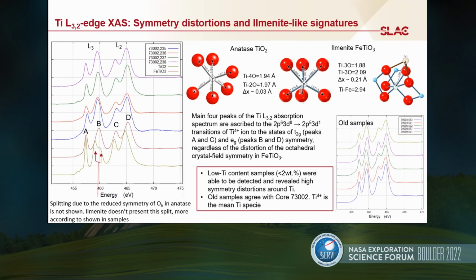Comparing the new samples with the old samples, this is in agreement. It looks like titanium 4+ is less susceptible to aging or being affected by time.